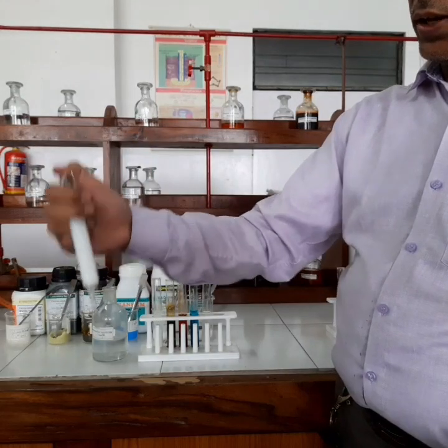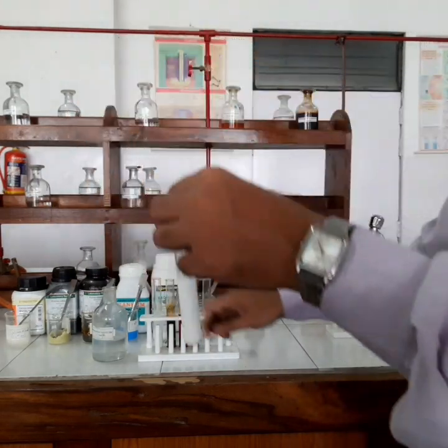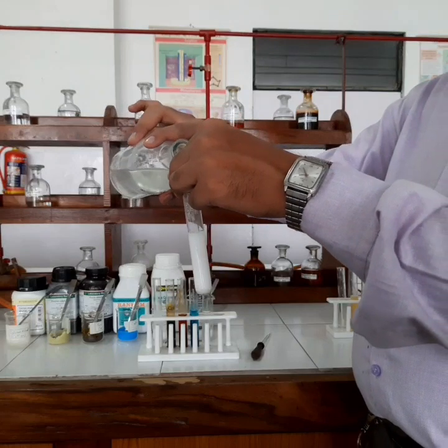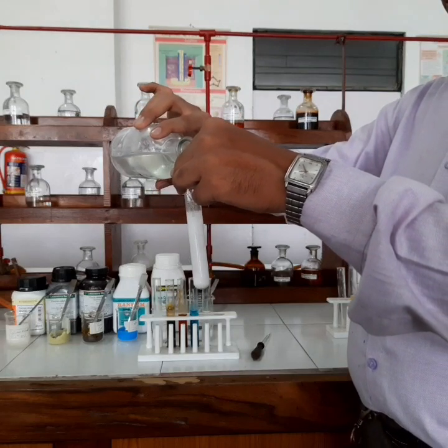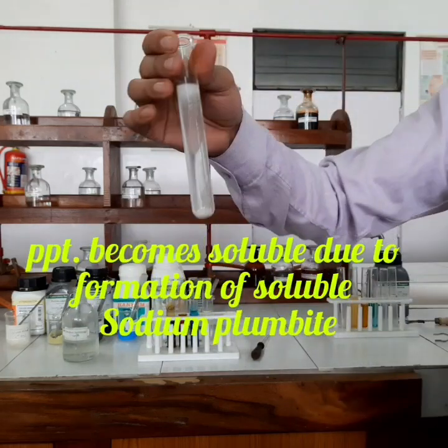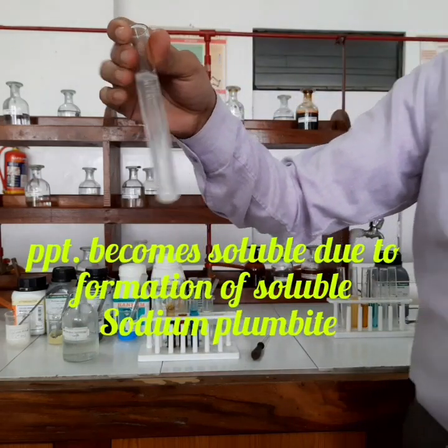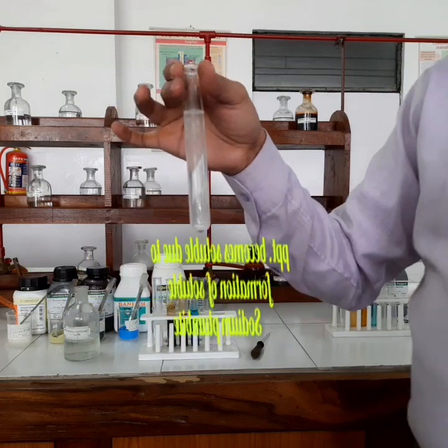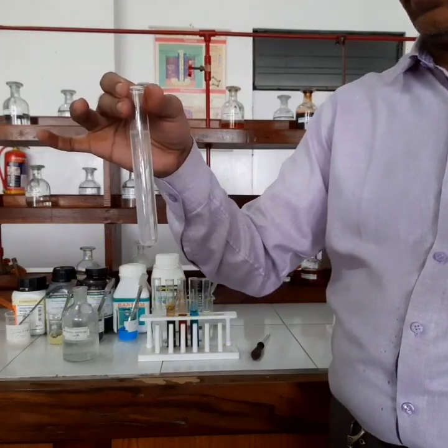Now I am going to add NaOH in excess, and let's see what happens. As you can see, the precipitate of lead hydroxide that has been formed, that was milky white, that was chalky white, sorry, has disappeared because of the formation of the soluble sodium plumbite.